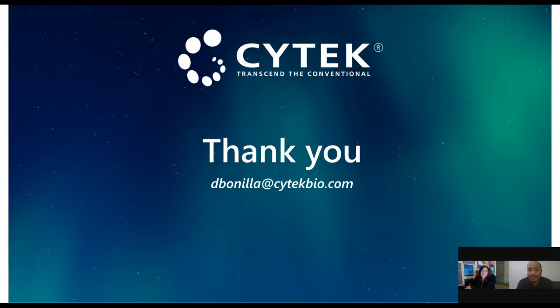Let's get started. Our first question is about a project on aging, and they're wondering, based on your experience, will aging autofluorescence be a problem in FACS?